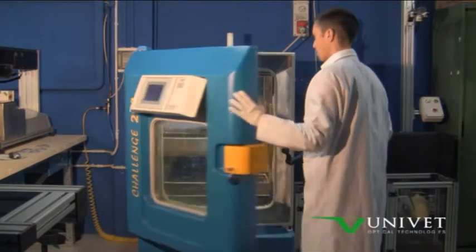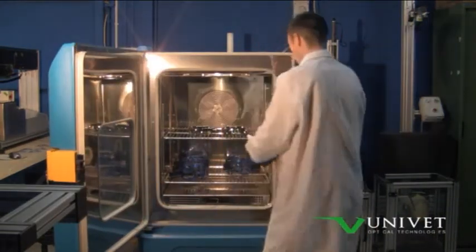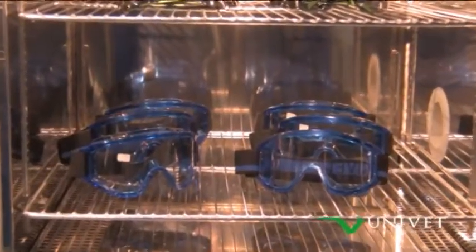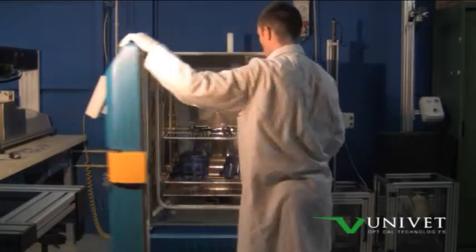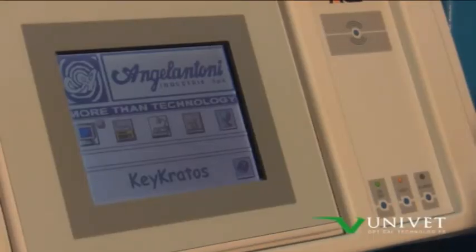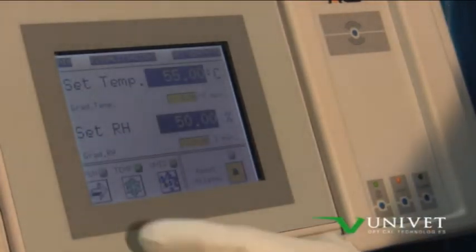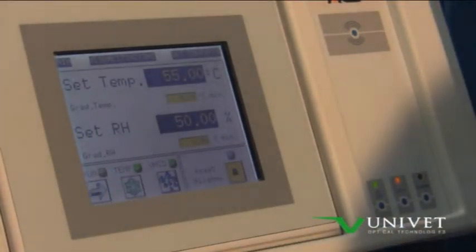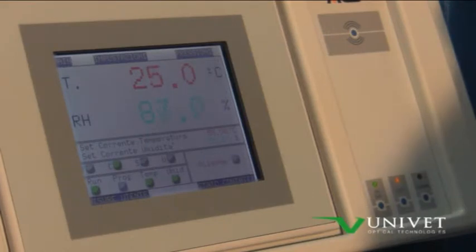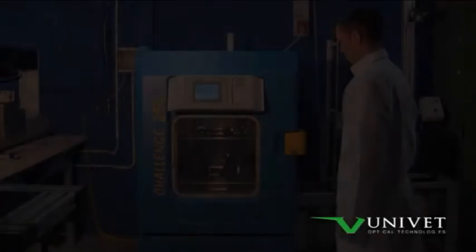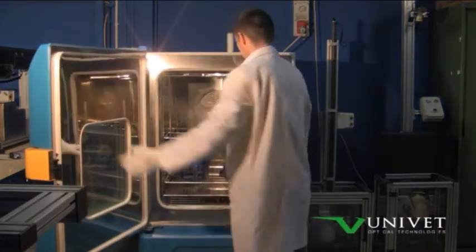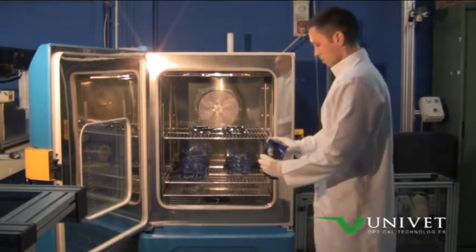The climatic chamber is used to condition the samples before performing impact tests at a given temperature and relative humidity. The EN166 requires that the impact resistance test at extreme temperatures is done on samples conditioned at minus 5 degrees and plus 55 degrees Celsius for one hour. The capabilities of this machine also allows the verification of performance of PPE to extreme temperatures, such as those that may occur in very cold or very hot environments.